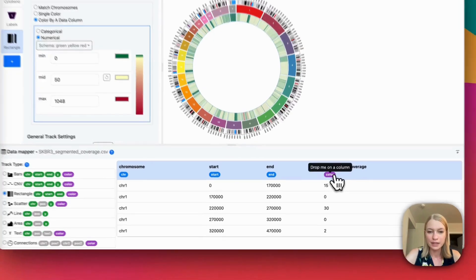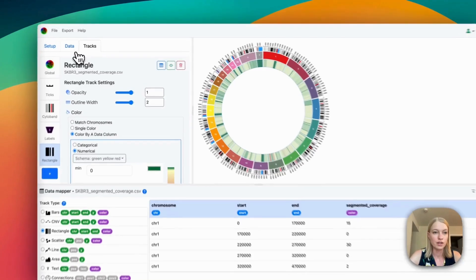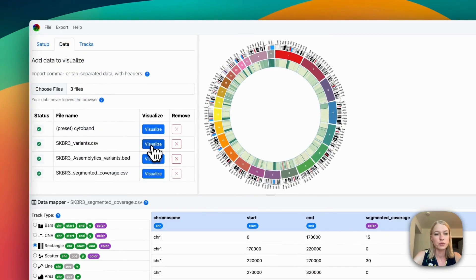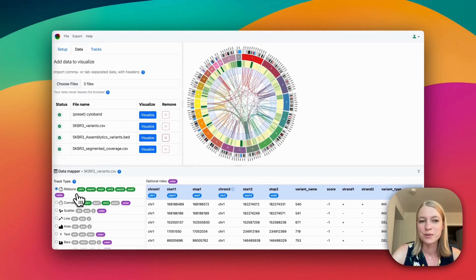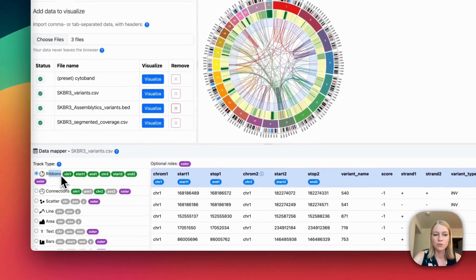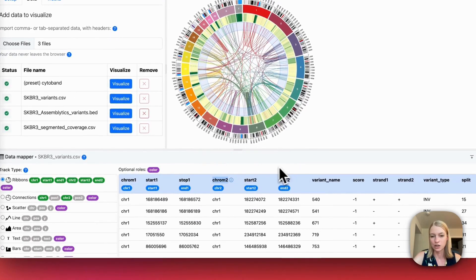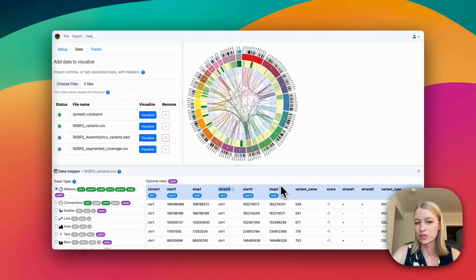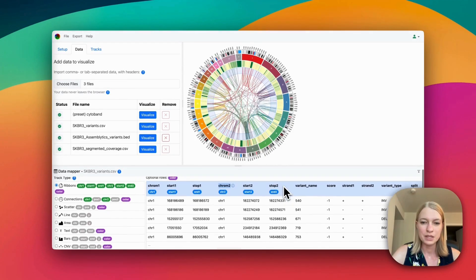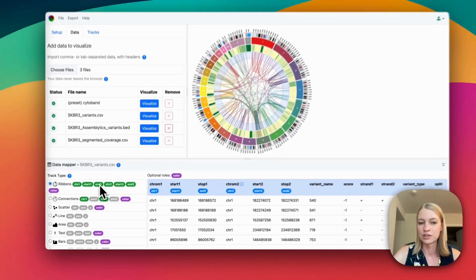Instead of coloring by segmented coverage, you could also color by something else in your data. For instance, if we visualize variants — these are long-range variants — it's automatically chosen the ribbons visualization type, because it found chromosome 1 and chromosome 2 in the column names, along with a start and stop position for each chromosome. So it most closely matches the ribbon type.